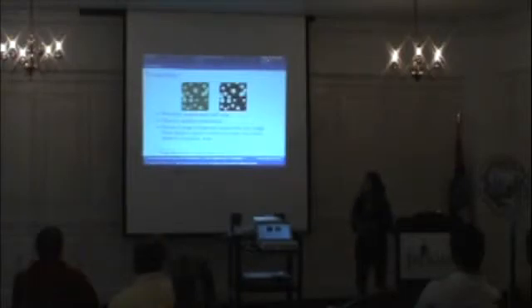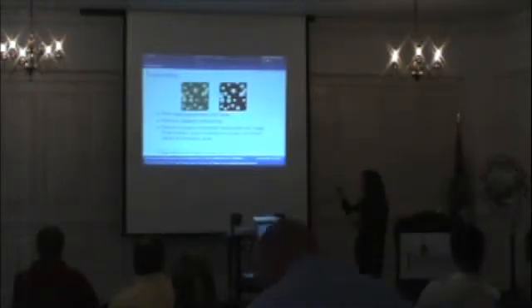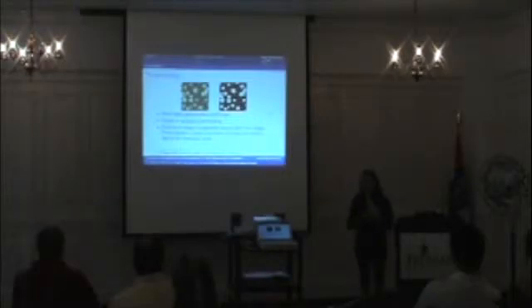So the first technique I'm going to talk about is the most basic. It's called thresholding, and there are a few types of thresholding. There are global and adaptive. Global, which I'll mention first, is where you take an image like this grayscale image right here, and you find a range of brightness values from dark to bright, usually using a histogram. And you would pick a threshold value on there.